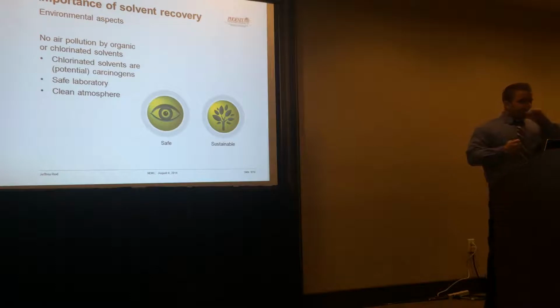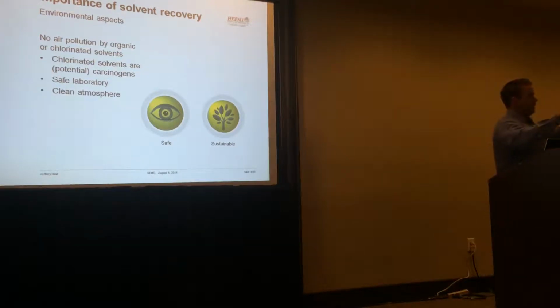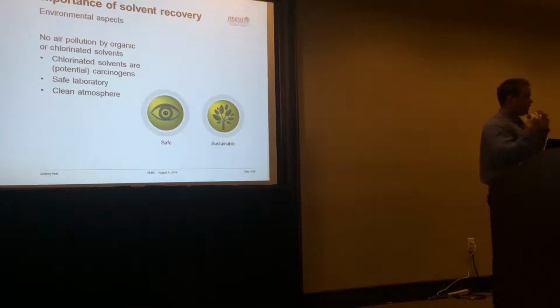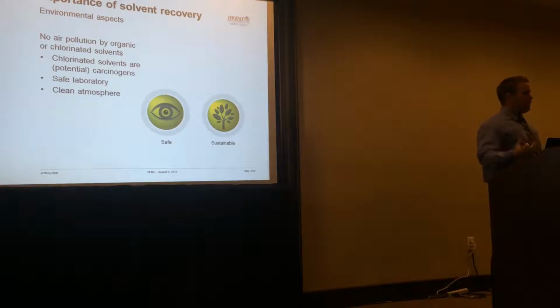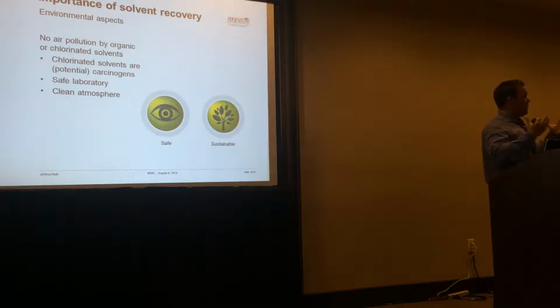You can see that whatever industry it is, environmental, pharmaceutical, whatever chemical, everybody's approaching chemistry more green. Green chemistry is bigger than ever now. So it's very, very important to start collecting your solvent, especially as environmental industry leaders, that I see some here, that it's good to have that front line to say, yes, we're the environmental company, and I'm sufficiently collecting this, and it shows the overall trend inside your marketplaces.